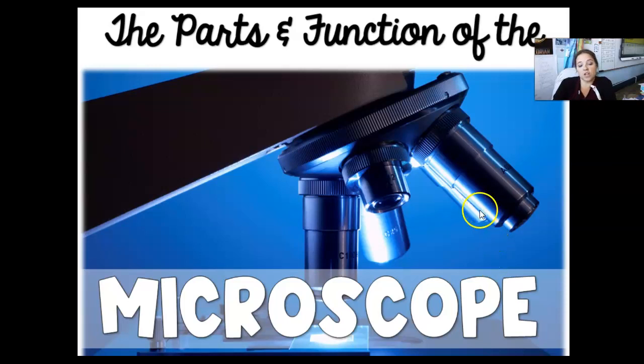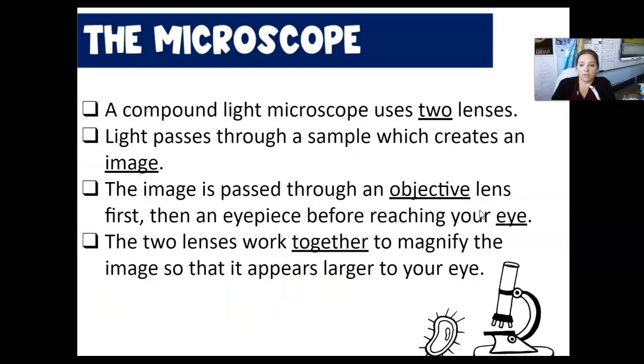Parts and function of a microscope. So this might be a little rehash of living environment. We're going to be looking at compound microscopes, and they use two lenses. Light passes through a sample, which creates an image. The image is passed through an objective lens first, and then an eyepiece before reaching your eye.